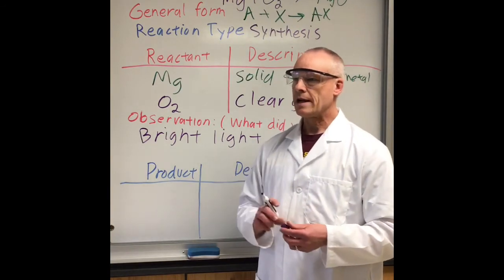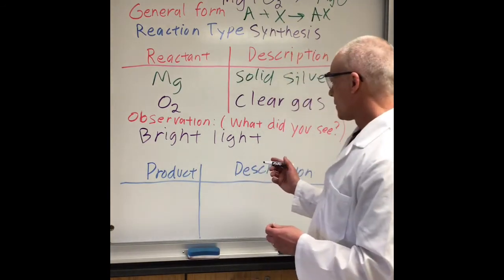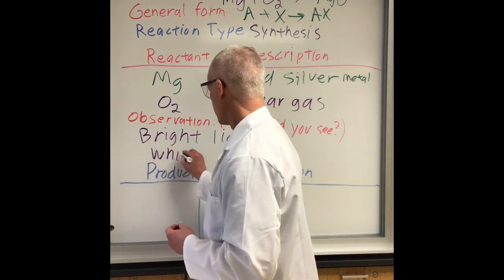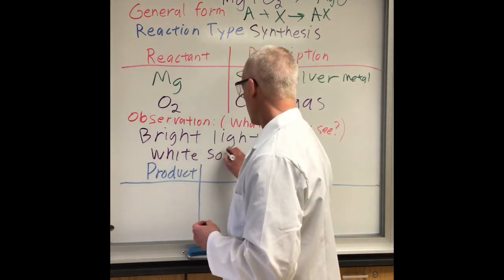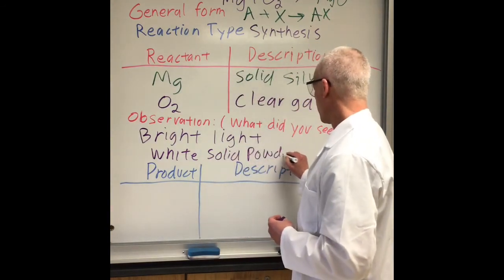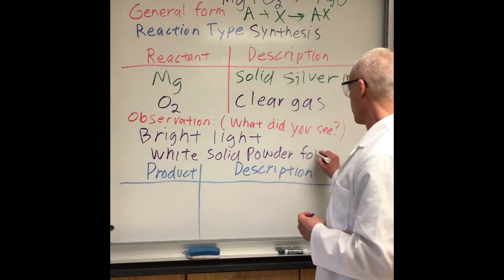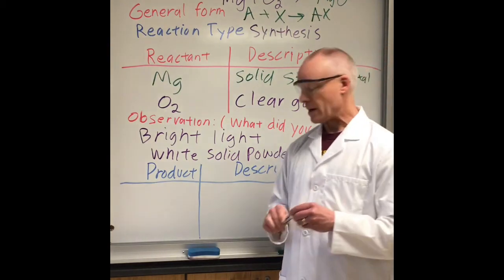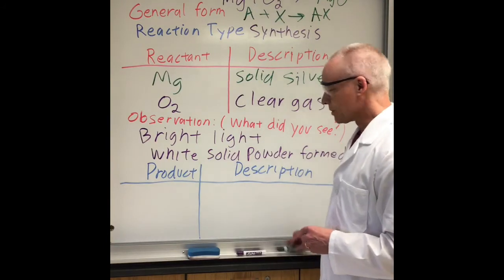The reaction was going on inside. And then you can also say a white solid powder formed. That's another thing you can say.